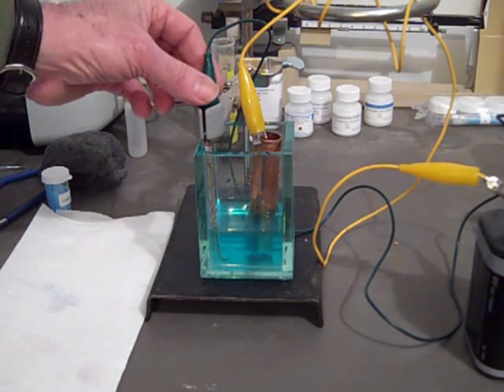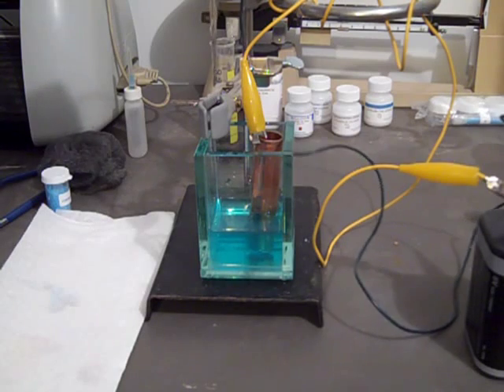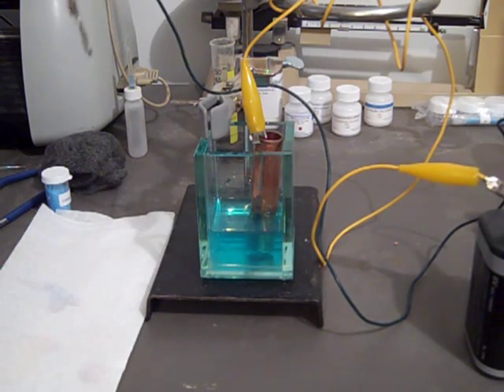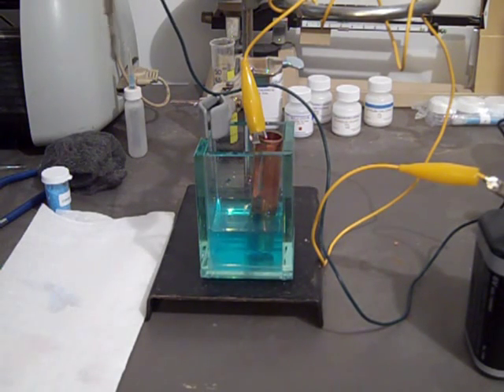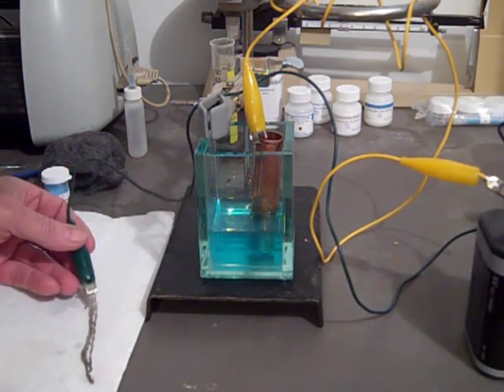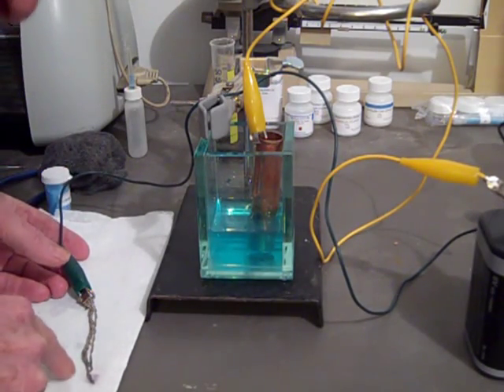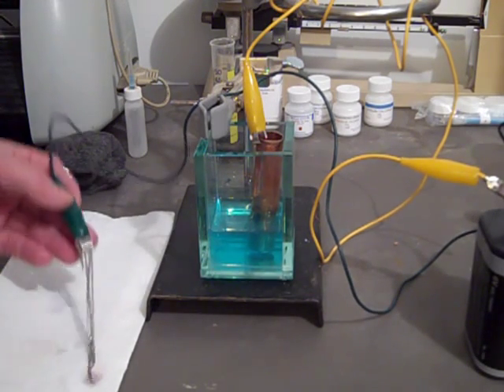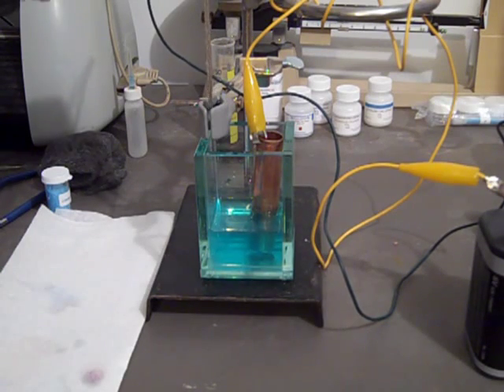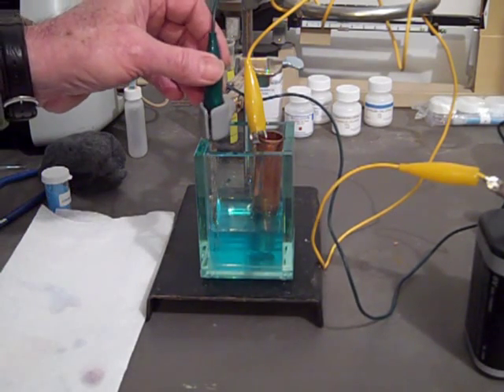That's about five minutes. Let's see if we got anything. You can see it's darkened slightly — definitely darker, maybe a brownish color. We'll put it back and write down our observation: darkened slightly.